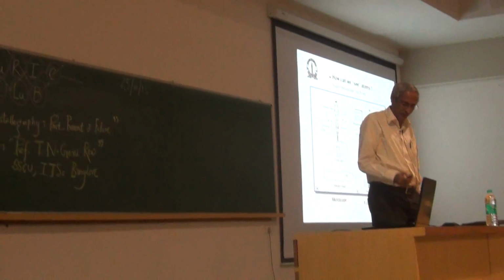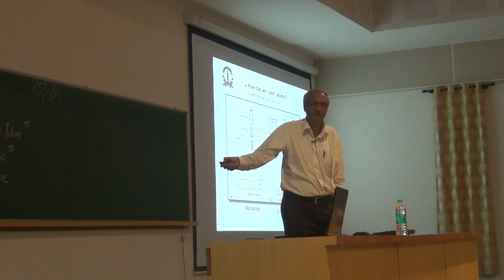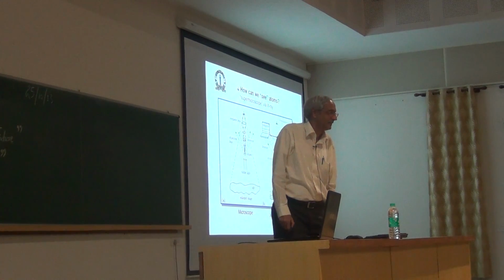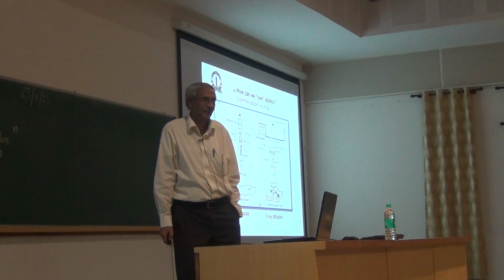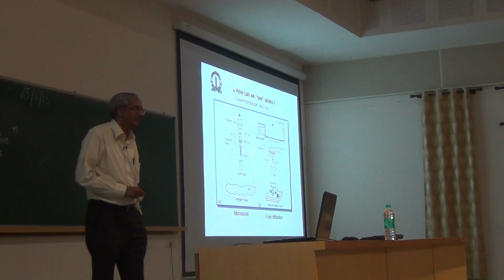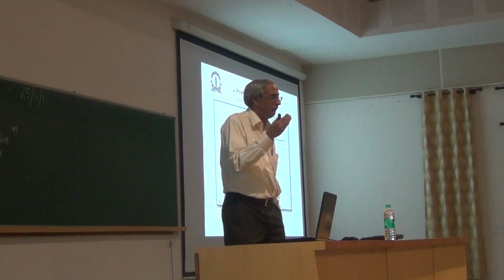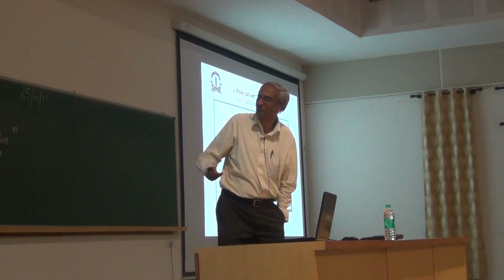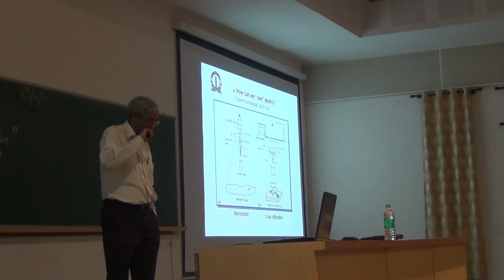And it now so happens that this fellow, as I mentioned already, is a dispensable character. You need only that, because he has already done whatever is to be done for this. So that now supersedes, and it all depends upon how fast this works that your structure determination proceeds. In principle, you can determine a normal, well-formed organic structure of about 20 or 25 atoms in a matter of 2 hours. And that's the state we have reached with X-ray diffraction.